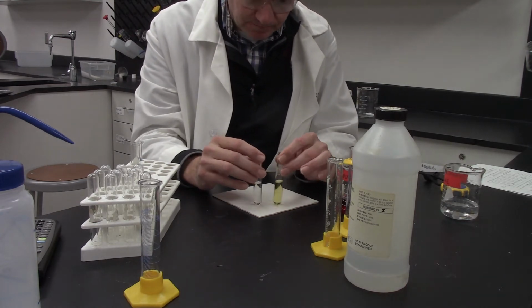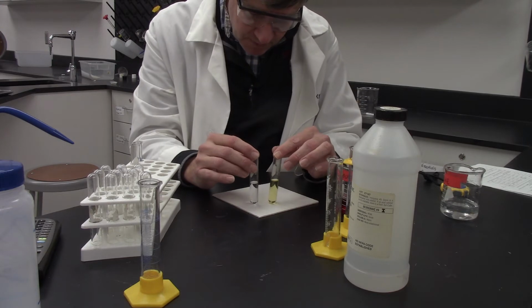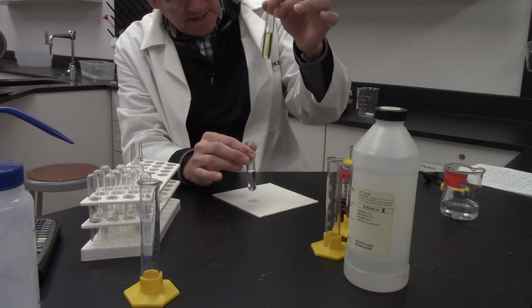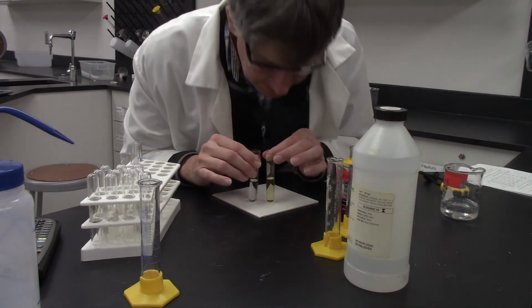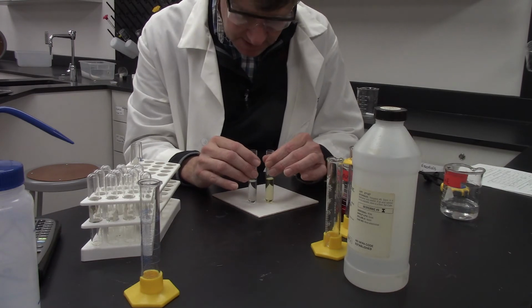So right now we're just sitting here watching the mud dry, basically. So we're looking down. Today we'll be watching hers, and you can tell that it's already faded quite a bit. And as soon as I look down and see that it looks like clear water, then I'm going to stop the stopwatch.